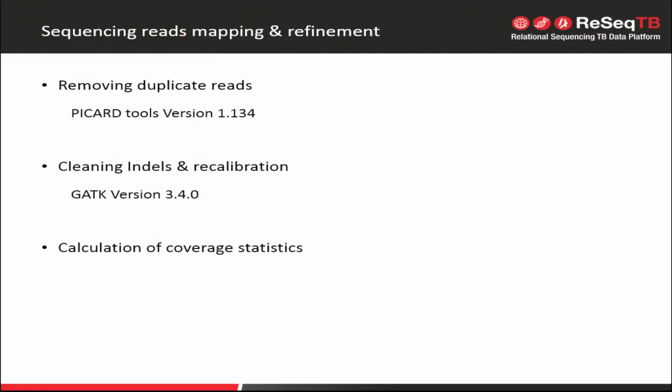We've also got some custom scripts that we built, because we want to look at the average coverage not only across the whole genome, because we have to set thresholds there. We really haven't come up with a hard threshold, but those are decisions that will have to be made hopefully later on Thursday, Friday, when the ReSeqTB expert panels meet face to face. But we also look at the average coverage of the drug-resistant loci, and there are about 40 different loci. We want to make sure nothing is overrepresented or underrepresented in those areas. Because if in the rrs or rrl regions, which are basically your 16S or 23S, you start seeing double or triple coverage, then it tells you that you may have contamination. So we had to put in a couple more filters.